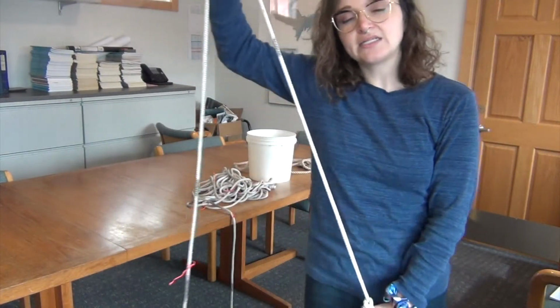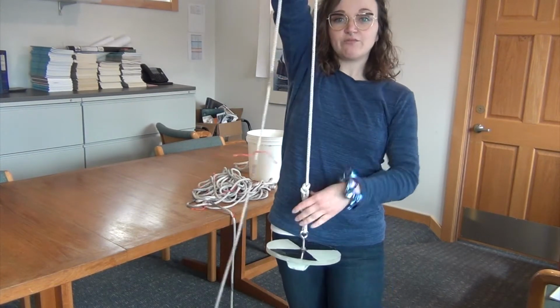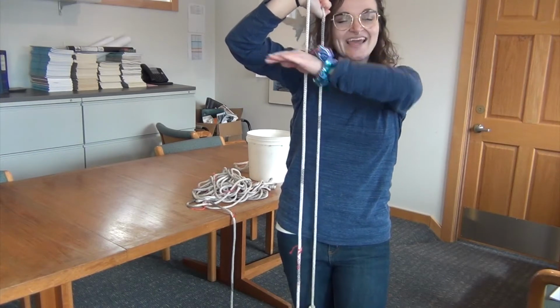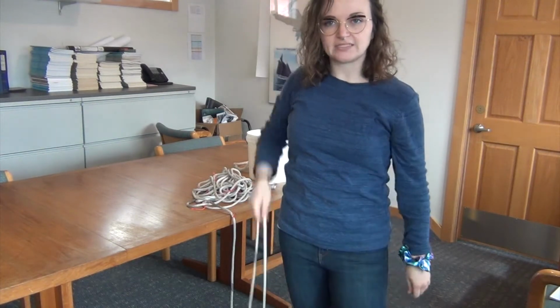And the way that we're going to introduce this to the students so that they can measure it, okay, is we count 1 meter when this pink line hits the water, okay? So if my arm is the water level, bloop, that's 1. It's not when it gets over the side of the boat, but when it hits the water. So you're going to lower this all the way down.